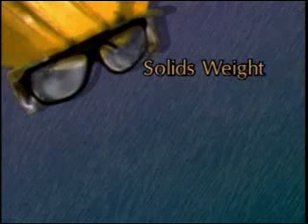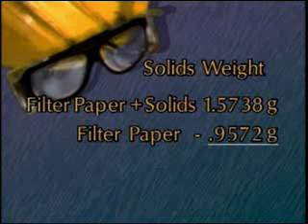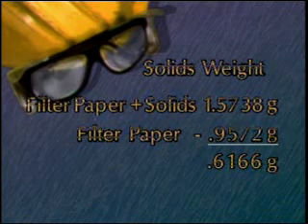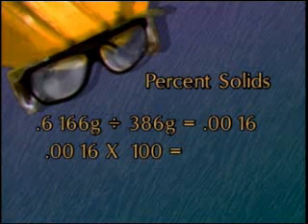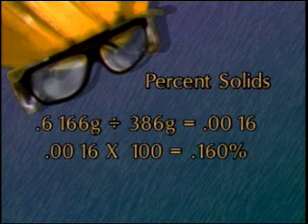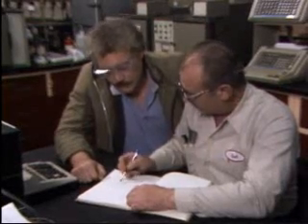1.5738 grams. Now, the actual weight of the solids can be determined by subtracting the weight of the filter paper from the weight of the filter paper and the solids. In this example, the solids weigh 0.6166 grams. Next, the actual weight of the solids is divided by the actual weight of the entire sample. Then the answer is multiplied by 100 to determine the percentage. In this example, the sample contained 0.160% solids. The results of the percent solids test are used to see if the process is within specifications.